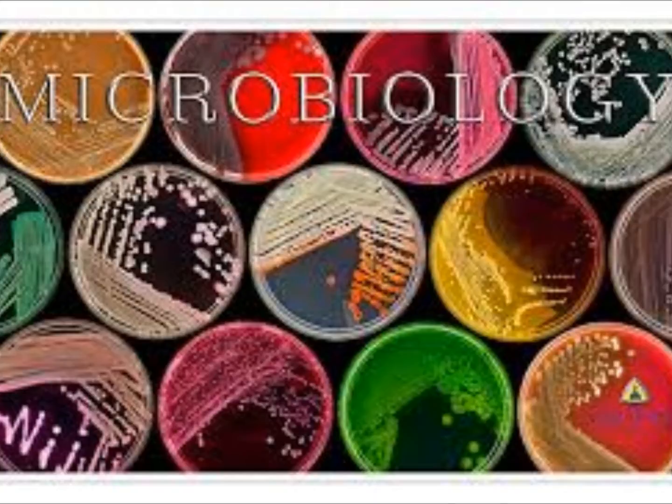The pigmentation. That's why you have that second plate that says white, clear, yellow. We look for the color of the organism. Like I said earlier, if you see a lemon yellow, it usually means Micrococcus luteus. There's tons of organisms that are white, tons of organisms that are gray. Clear, some of our streps, our beta hemolytic streps, are just clear colonies. So those are all factors that help guide us as well.